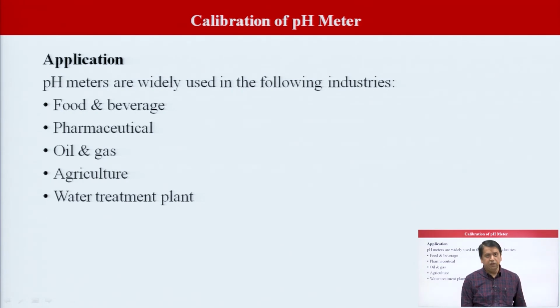So, there are a lot of different usages of the pH meter in the pharmaceutical industry. This is one of the very important and basic pieces of equipment that you all might have seen in your colleges as well as in all kinds of analytical laboratories.